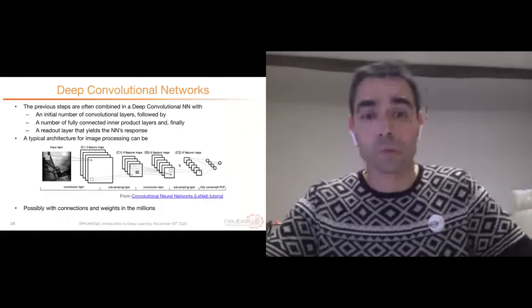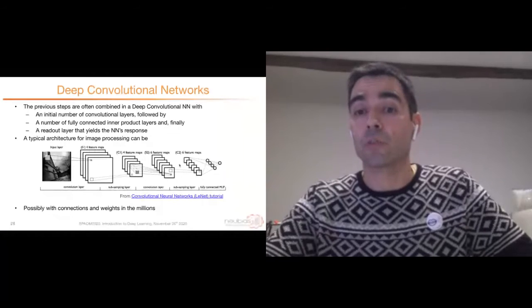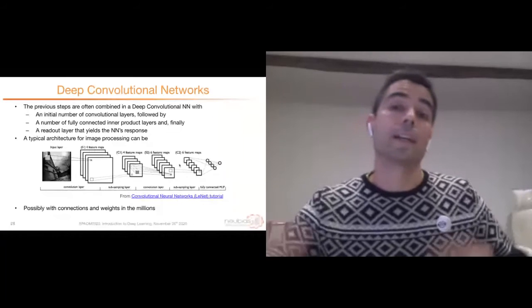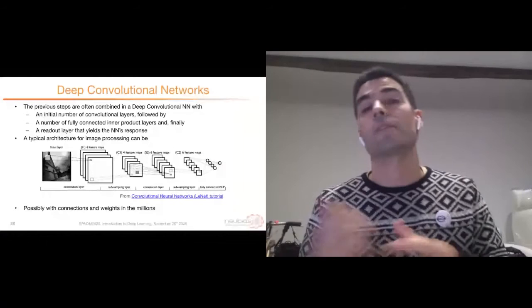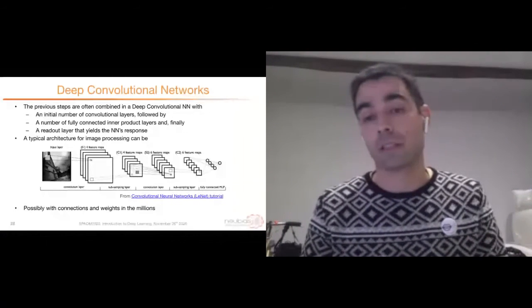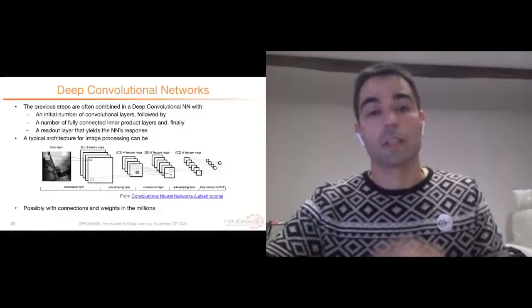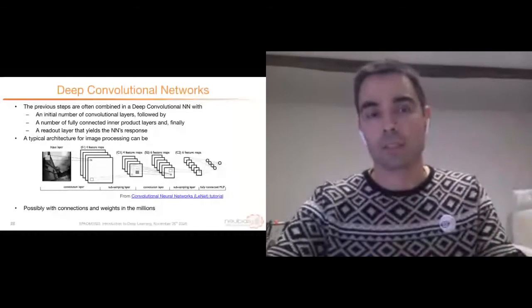And why is this useful? Well, because we can train this end-to-end with backpropagation. We calculate the weights of the filters as well, and those filters are specific to the problem. It's not like before, where we had to predefine some filters and then see if they were good enough and then use them with a specific classifier. Here, everything is done for the specific problem, and usually with connections and weights in the millions.